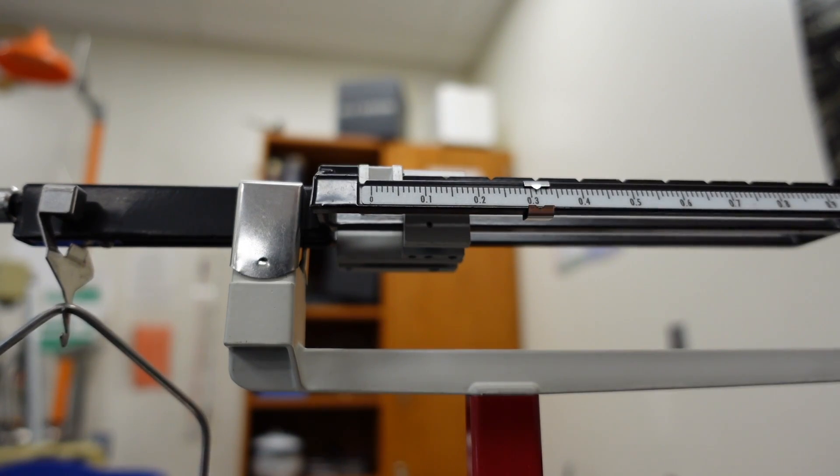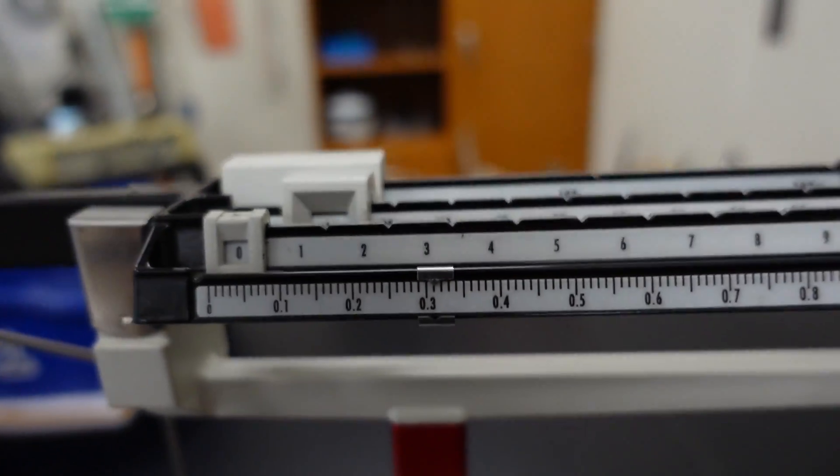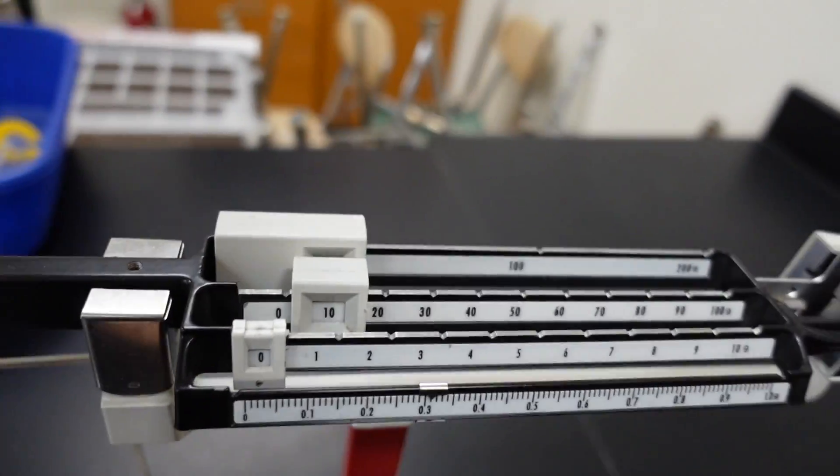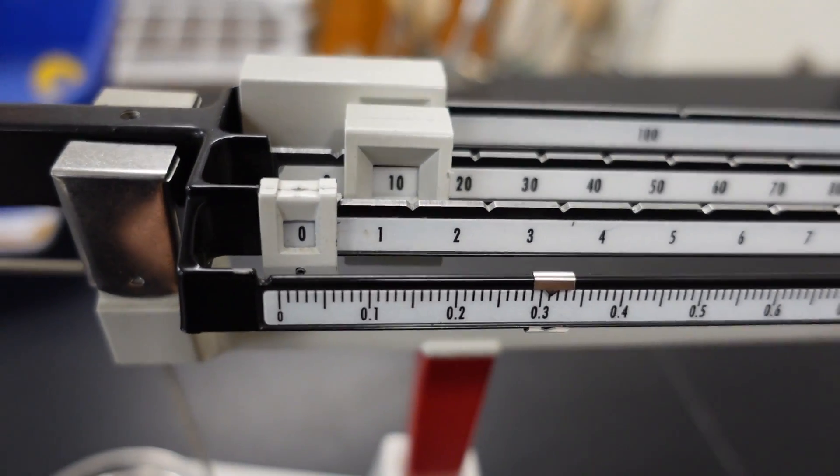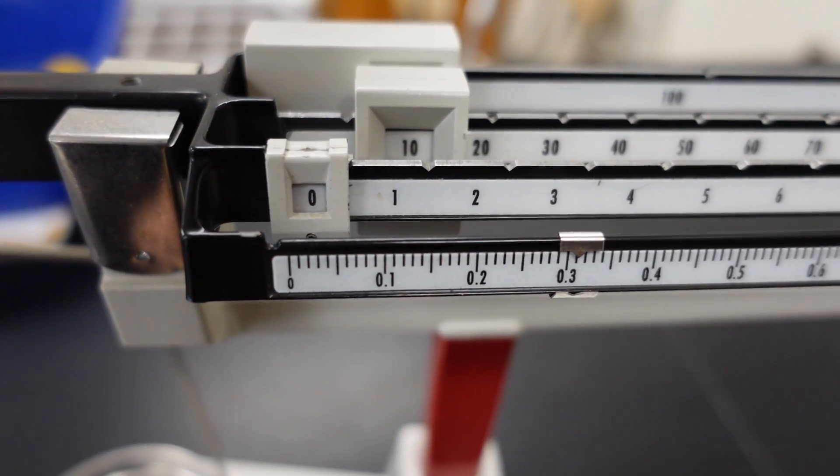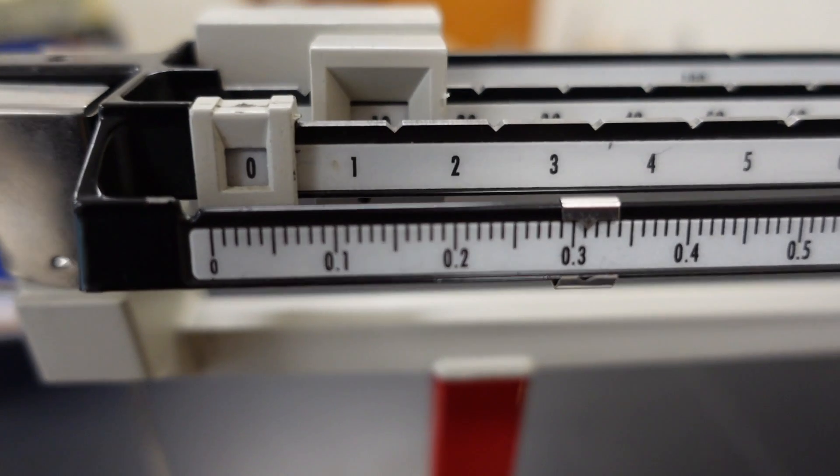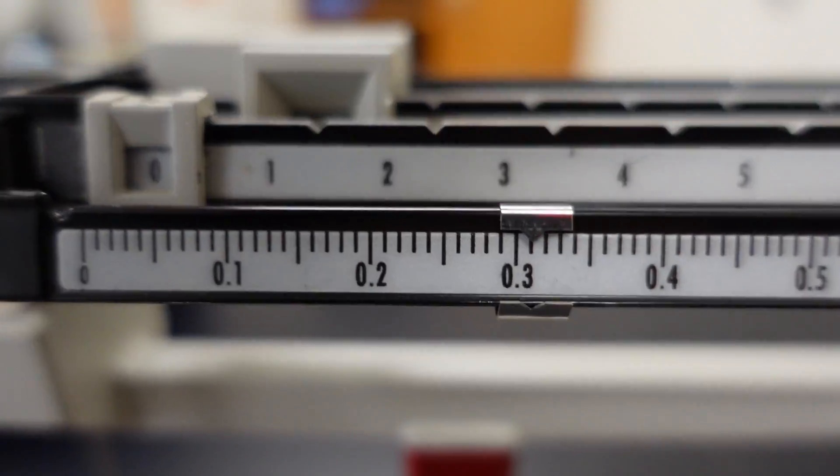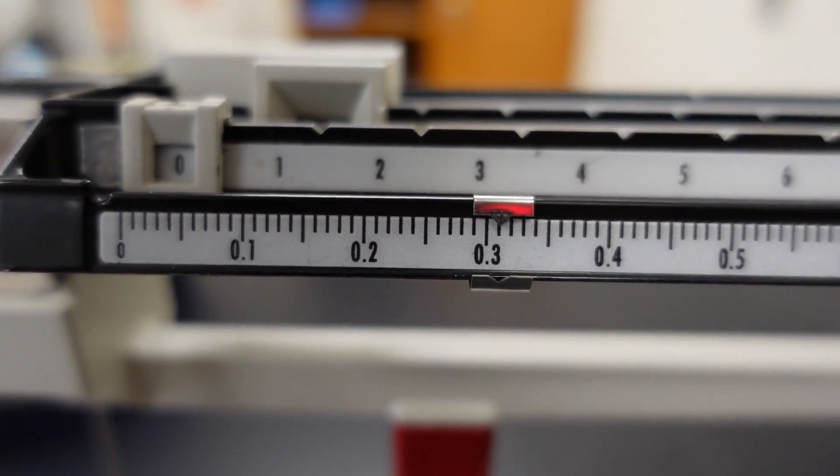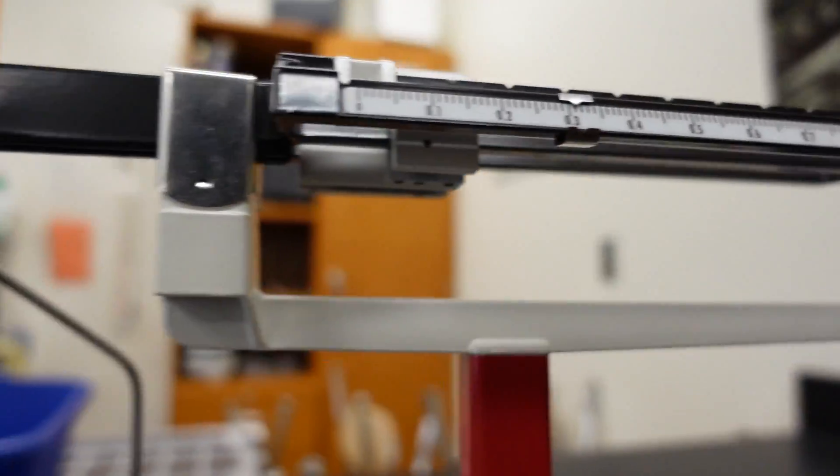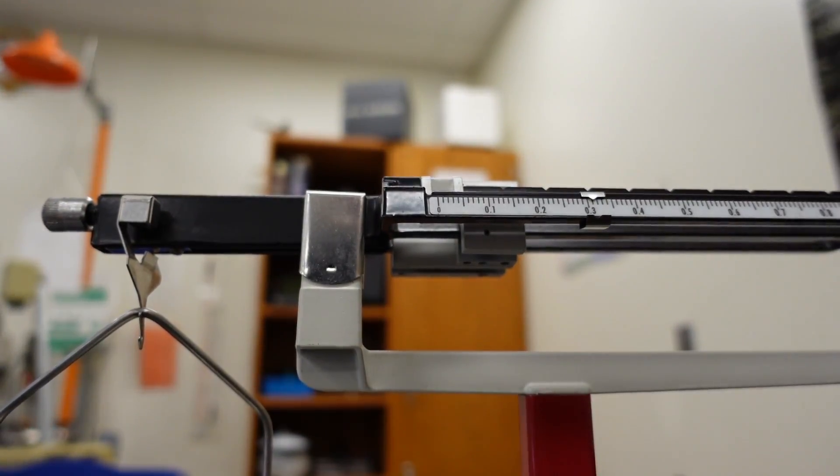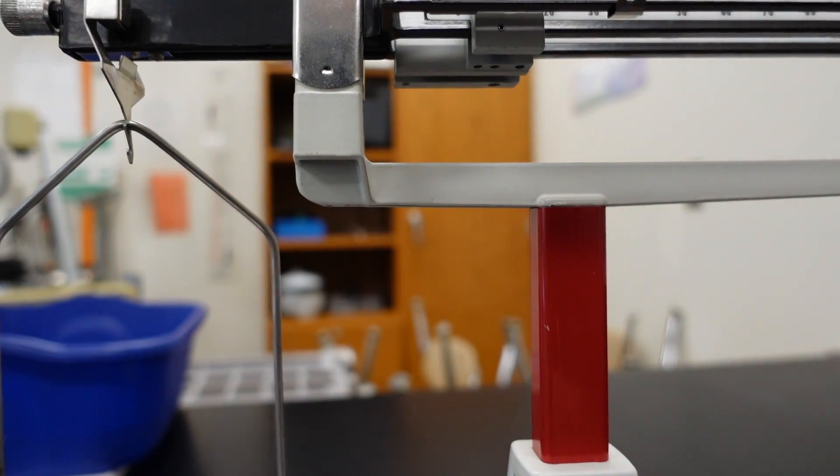So we place the candle on the balance and then we are going to adjust the sliders. Okay, so there we are. So record this measurement.